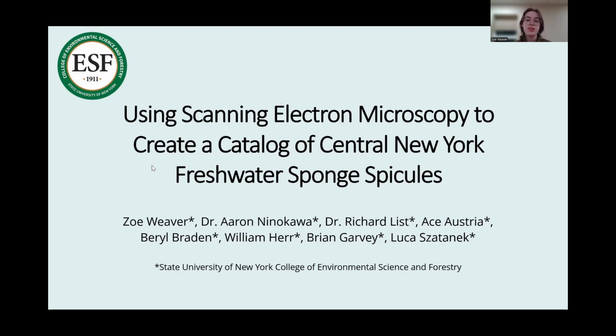Specifically, how we've been using scanning electron microscopy for our applications. So SEM has been the gold standard for imaging spicules for a while now. It allows better, higher resolution than a light microscope ever could, and that allows us to not only create this catalog with very good images, but also we can use it for analysis of the spicule morphology.